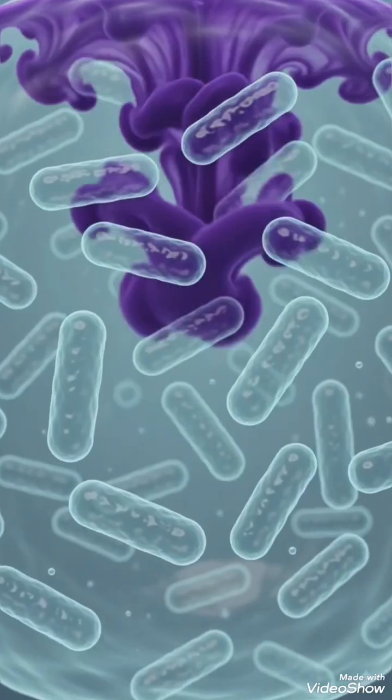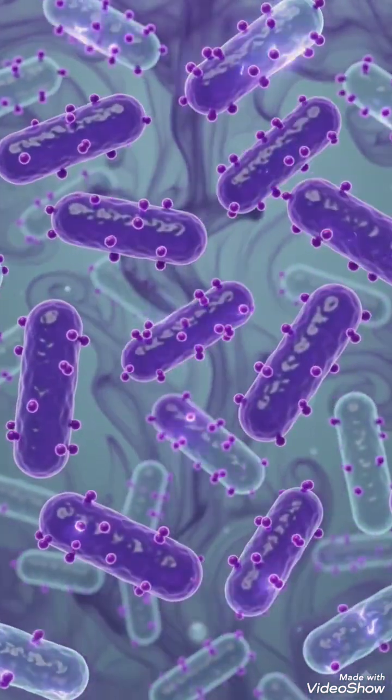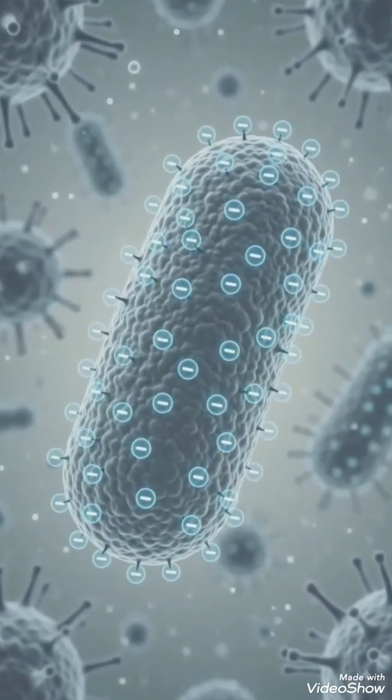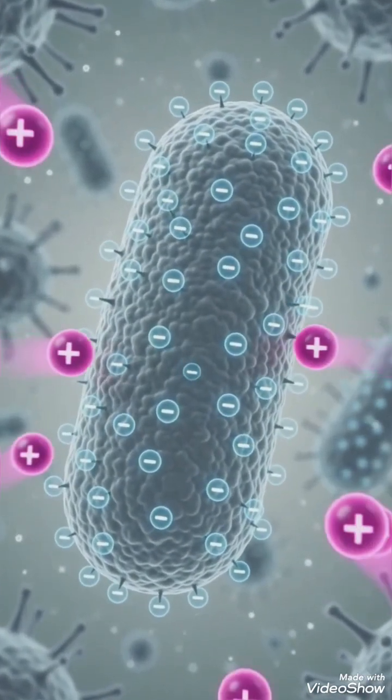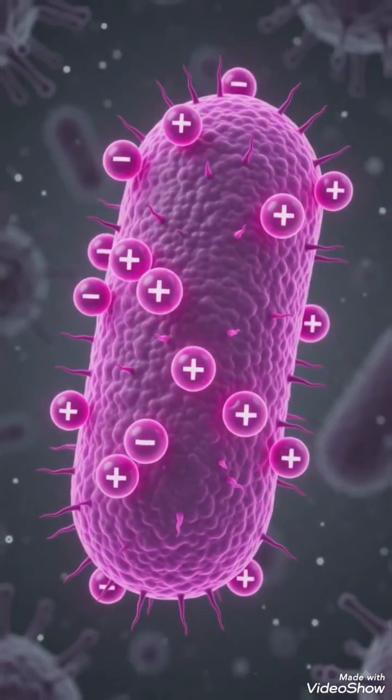Basic dyes bind to bacterial cells. This causes the cells to become colored. Common basic dyes are crystal violet and methylene blue. These are widely used. Bacterial cell surfaces are negatively charged. Positively charged basic dyes are attracted to the cells and stain them directly.